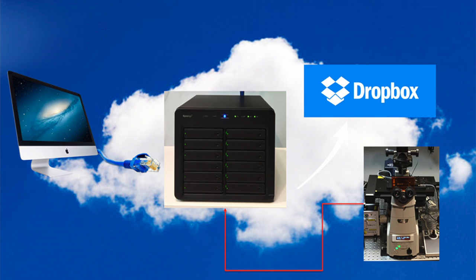So we anticipate that this center, as it currently is, is generating a tremendous amount of data, and with that comes the burden of managing all of this data. And so we have an infrastructure in place from a networking standpoint to deliver all of the acquisition data from each system in real time to a server, which we then allow all of our researchers and users on campus to access from their desk or remotely. So what we can do then is have data redundancy with various cloud syncs like Dropbox, where we can offload that data for more long-term storage.